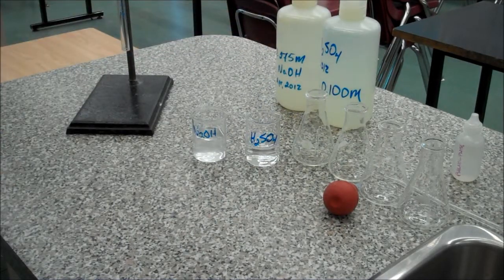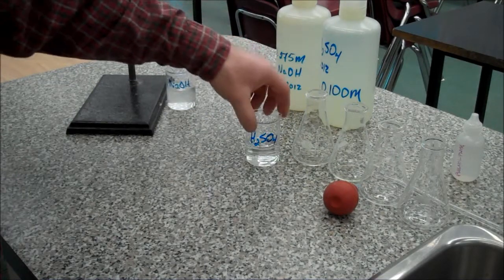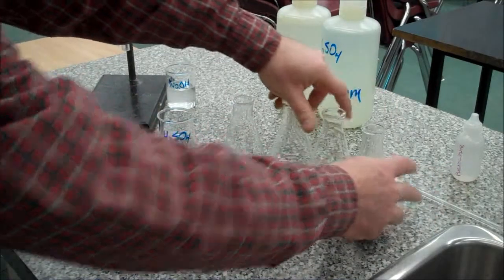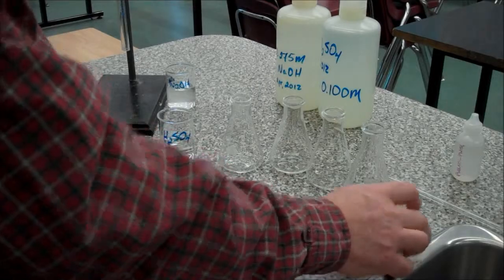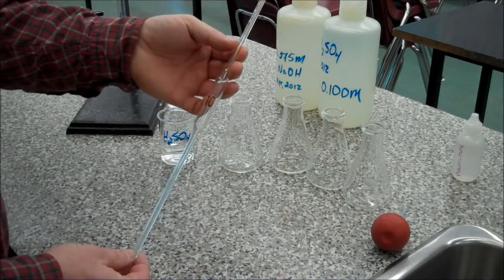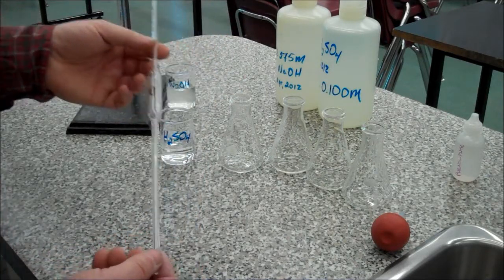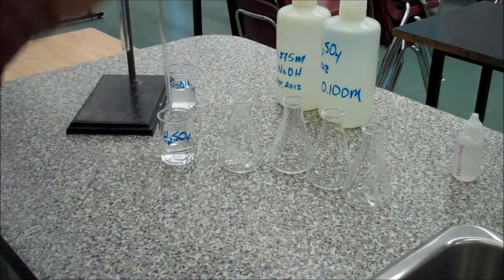Now, one of the things you need to do is prepare your samples. And so we'll have 4 samples in these Erlenmeyer flasks. Hopefully you can see those. And the first thing we're going to do is use a volumetric pipette, which has a single graduation on the narrow neck. And we need to equilibrate the glassware. What that means is rinse it with the solution we're going to be using. So we'll just suck up a little bit.